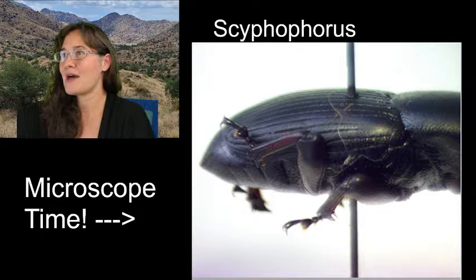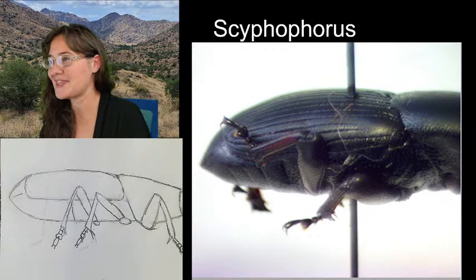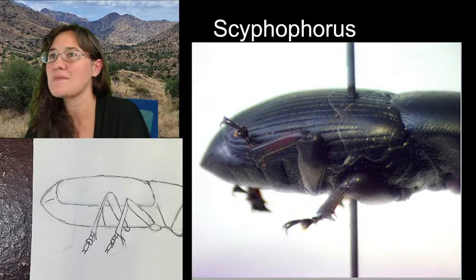Oh, come on. Well, I'm glad that we can see the sketch, because the microscope isn't letting me move it right now, but that's fine. So we are looking at the last handful of segments of the abdomen. We are looking here.